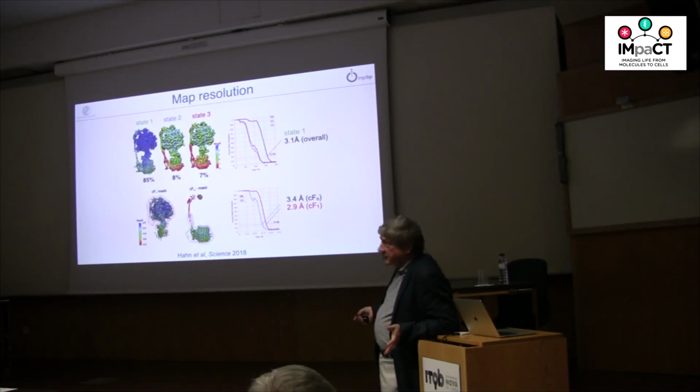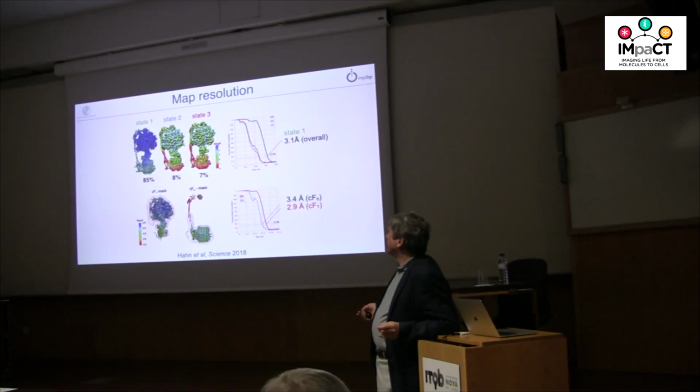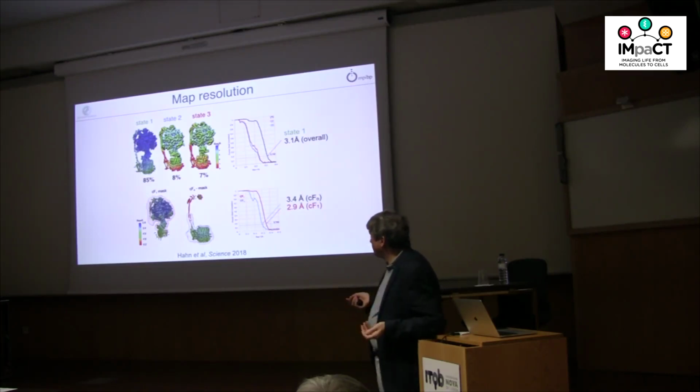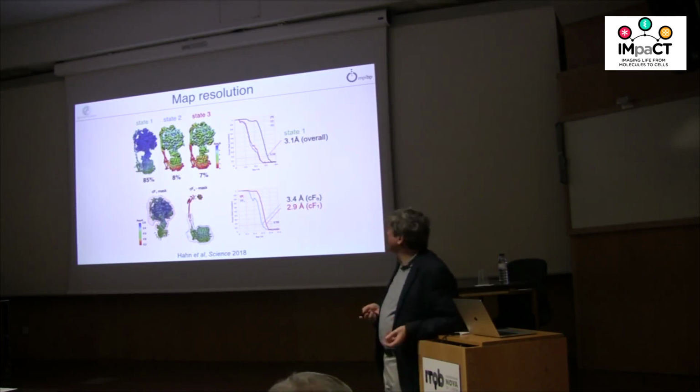And this is the great thing about cryo-EM. So you can separate things and look and analyze them separately. This was the earlier question. So it's not the same resolution for the whole complex, but it's better in some parts than the other. And in the more rigid part, it's better. In the more flexible parts, it's less good.